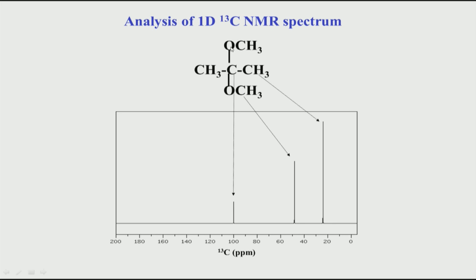So, the idea is to quickly capture the chemical shifts without waiting too long, but if you do not wait sufficiently long, the intensity is reduced because of the incomplete T1 relaxation. And that is why the peak intensity of these quaternary carbons usually is very weak. We will see this also in the case of aromatic systems, aromatic quaternary carbons.